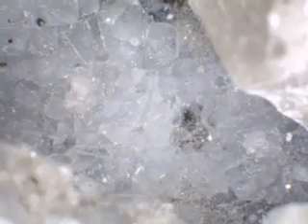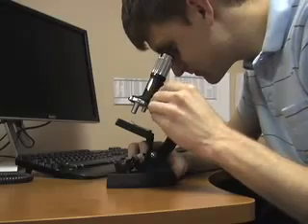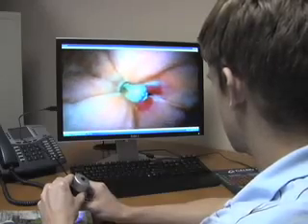Have you ever looked through a microscope and saw something so amazing that you wanted to take a picture or maybe even a video? Well now you can with the Carson Z-Pix. The Carson Z-Pix is a digital zoom microscope with integrated picture and video capabilities that is great for all ages. This digital microscope displays a live magnified image on your computer screen. Its magnification ranges from 26 to 130 power.